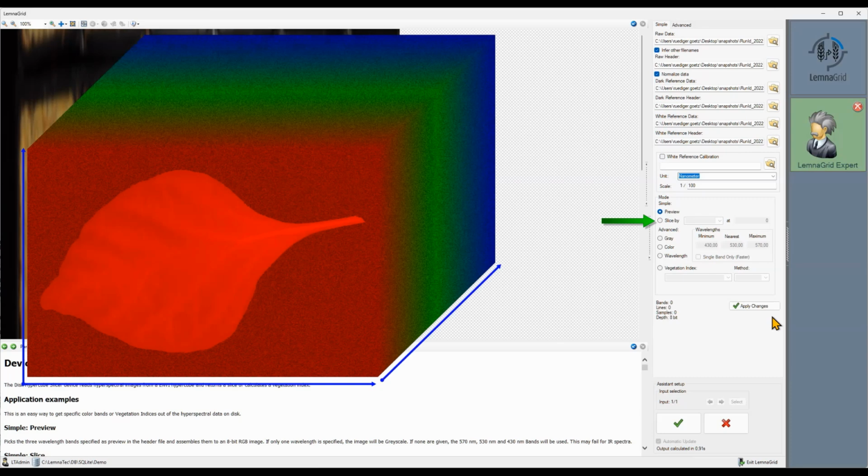In order to display this in a 2D fashion, as here, we could take a slice from this cube by cutting through the cube while keeping 1 spatial dimension or the wavelength constant.